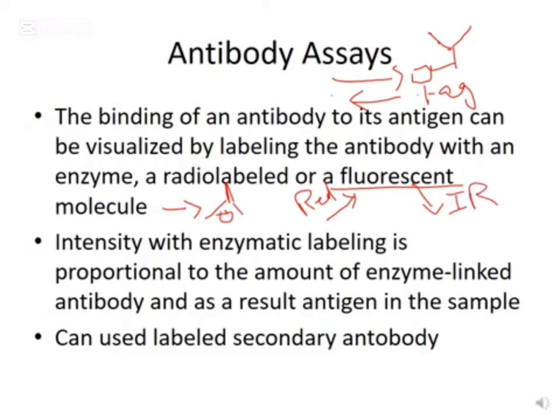So this is going to give me a lower red value, because of course if it absorbs light at a certain wavelength, it's going to absorb some of the energy and emit the rest of the energy back at a lower energy. So if it's red, it's going to give us infrared, which is not a very practical example. However, if it's green, it could, for example, emit light back at a red wavelength, depending on how well it absorbed the energy. So we can detect whether this reaction takes place or not.